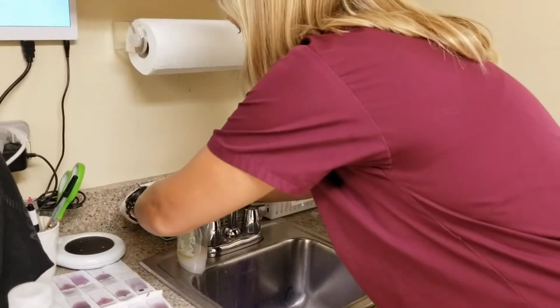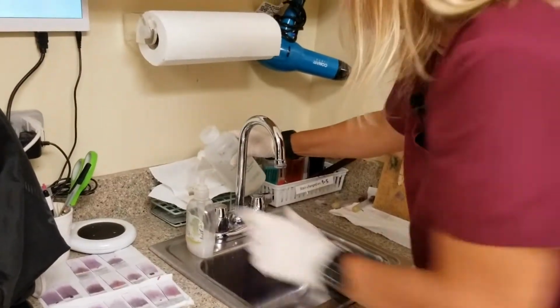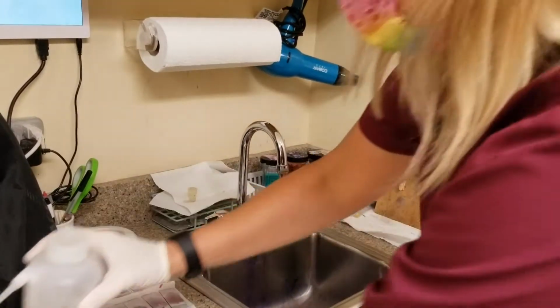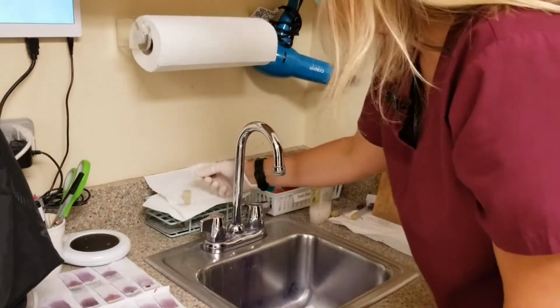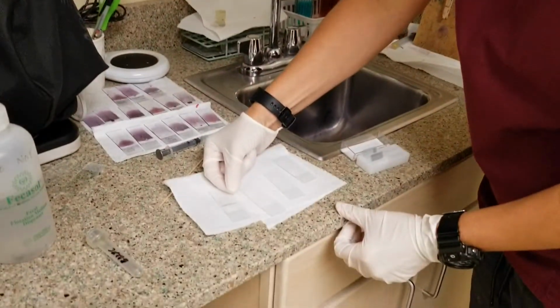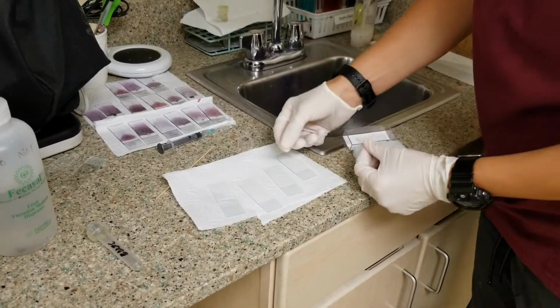So I set it in our little holder here. Fill it up, make a meniscus so the eggs can float to the top and stick to a cover slip. So we let that sit about 8 to 10 minutes. This guy here, the direct, I can just drop a cover slip directly onto.